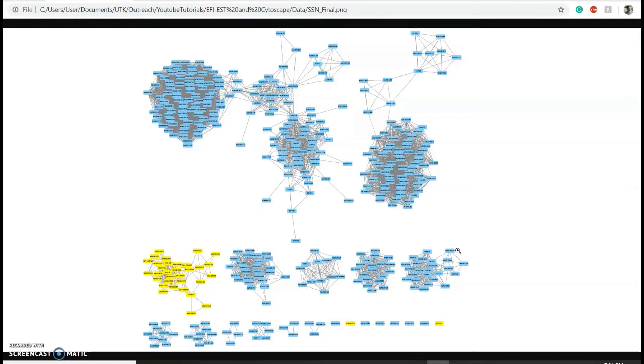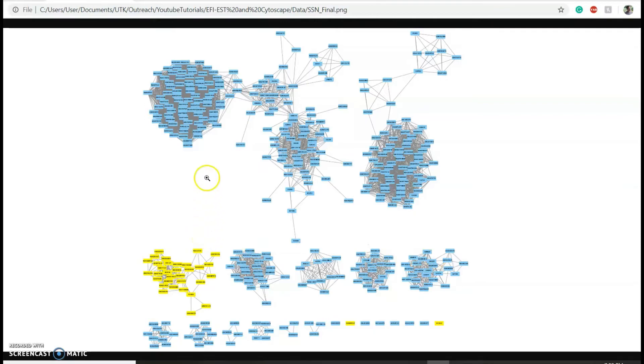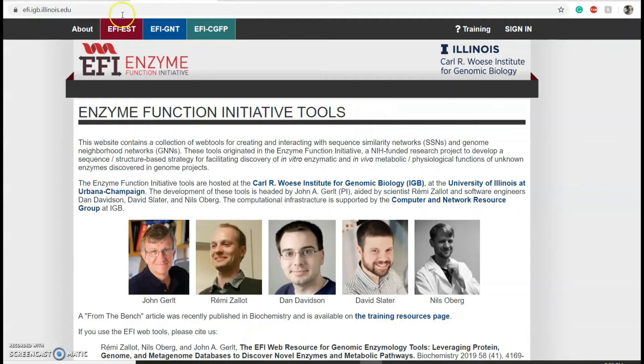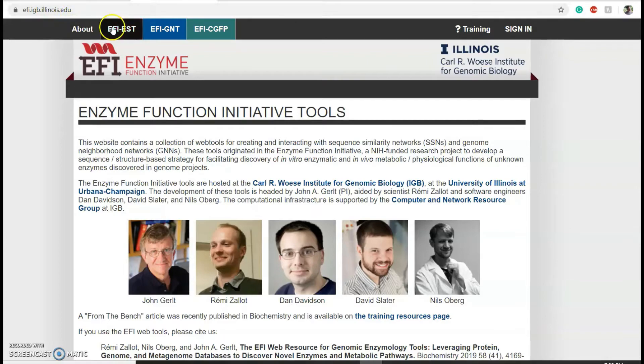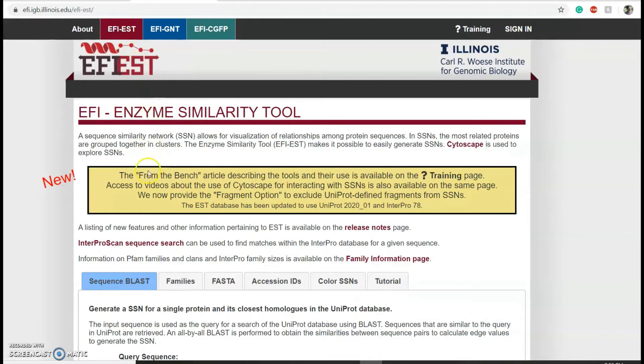I specifically want a network wherein nlpc homologs from Xenorhabdus are separated from nlpc homologs from other bacterial species for some downstream analysis. To do this, go to efi.igb.illinois.edu and click on EFI-EST.